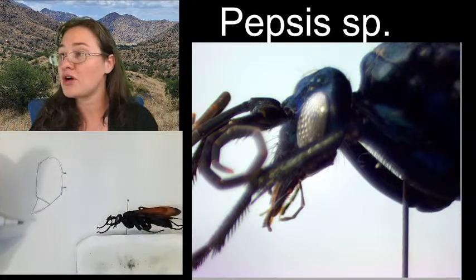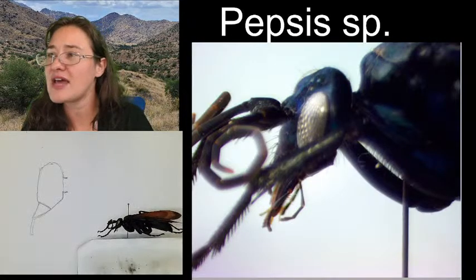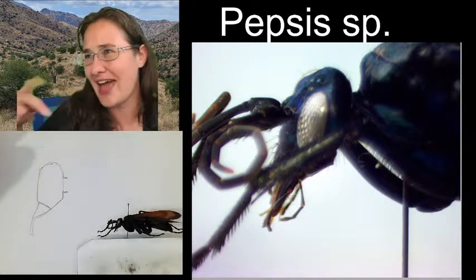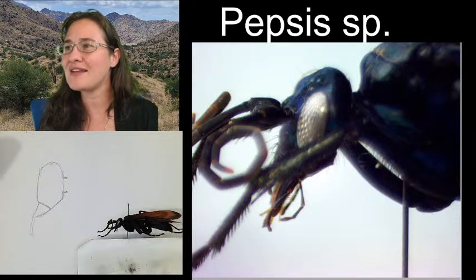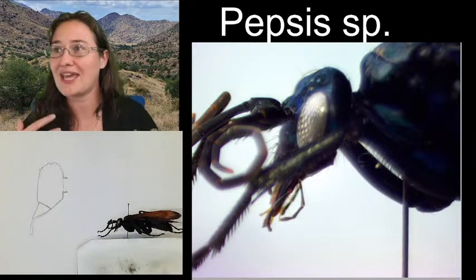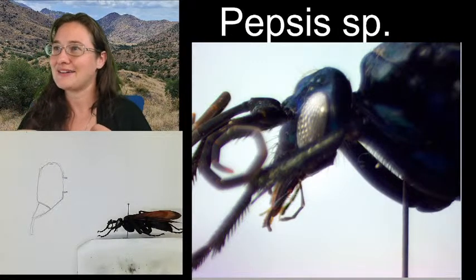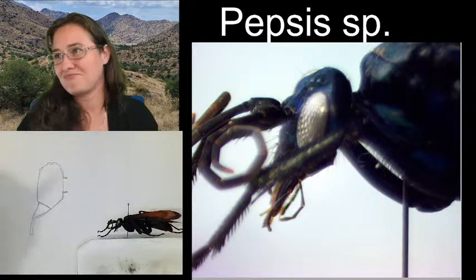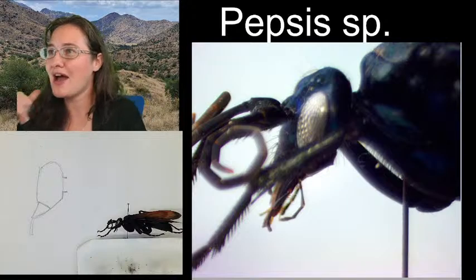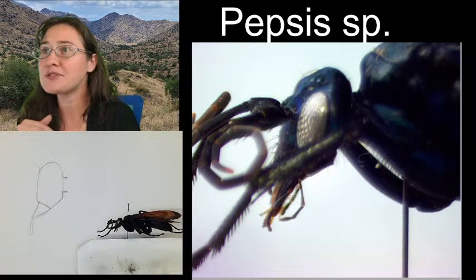And then you also have your, we're going to call them for this insect, lapping mouth parts, L-A-P-P-I-N-G, lapping, because it's not like a sucking motion. They don't really have a proboscis where they're drinking nectar. It's more like having a tongue that sticks out. That's kind of what it's like. We also have those palpi, or we can call them palps. They're mouth palps, the mouth fingers.